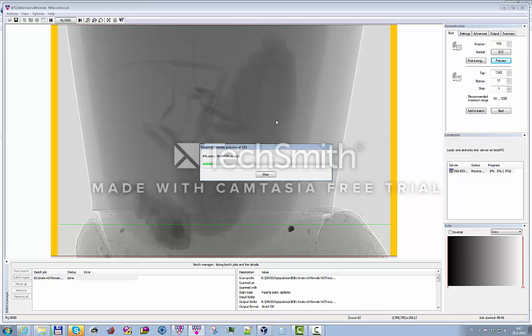I suggest that before going through this tutorial, you go through the manual for NRecon, because the NRecon manual, just as any other Bruker software manual, is very detailed. It has a lot of information, everything that you need to know, especially some small details, written very nicely, very clearly. So I suggest you go through the manual before doing anything, before loading any sample. Maybe just load some test sample and play with it a little bit, so that you have an idea what it is about.